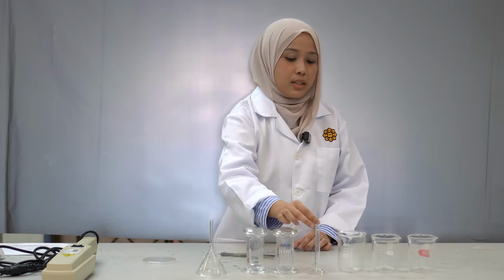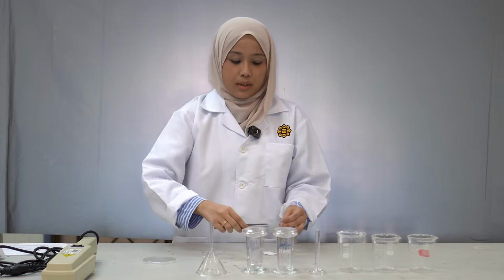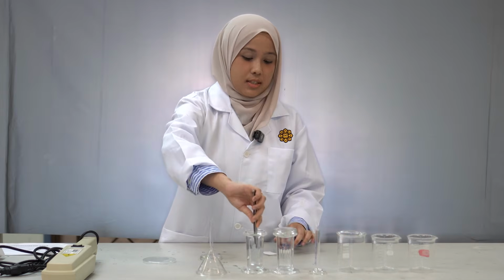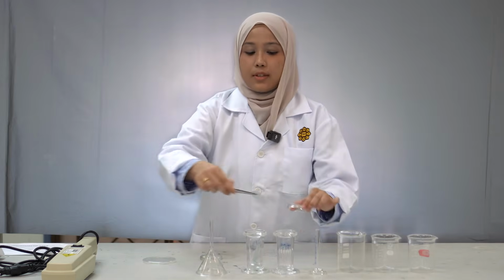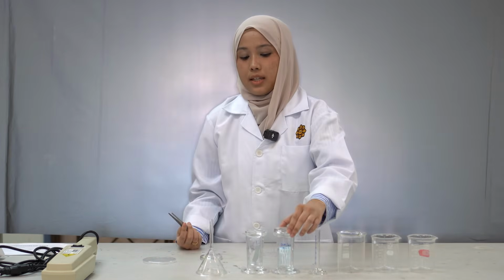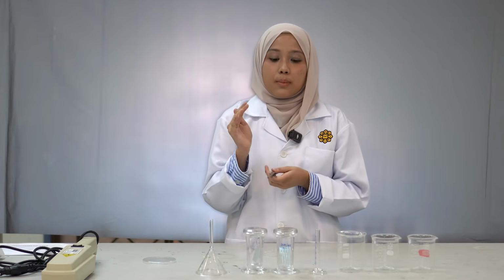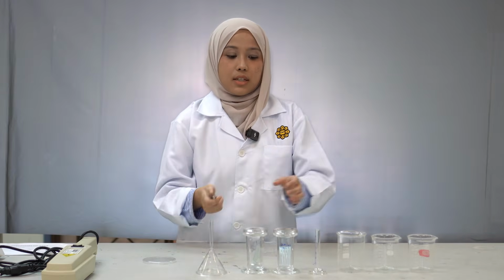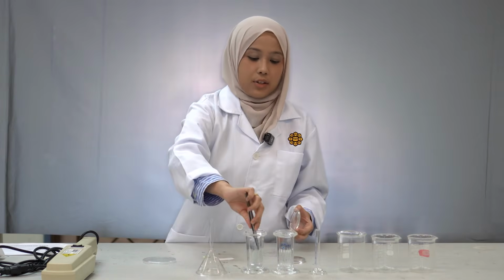After we have done spotting, we will take the plate and place it in the developing chamber gently and carefully. After we have placed it, close the lid and let it rise. Let the solvent rise until the solvent front, which is the line 1 centimeter from the top. After it has reached the line, we will take it out and let it dry.